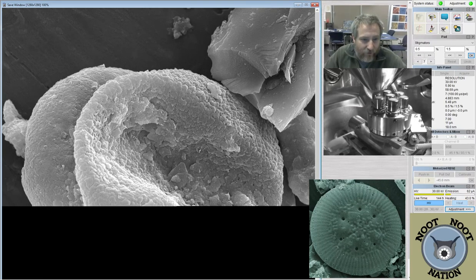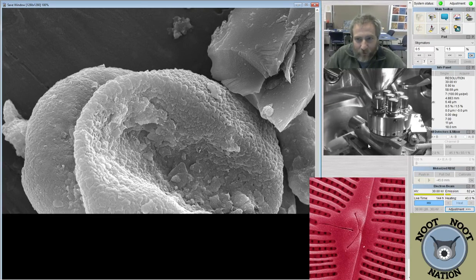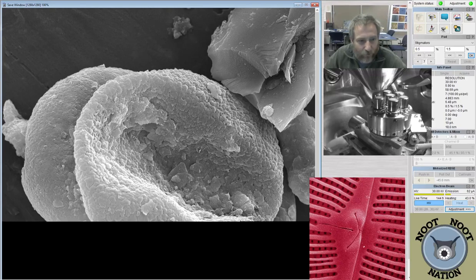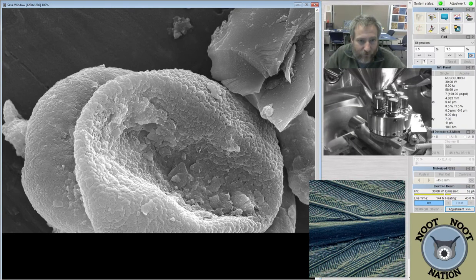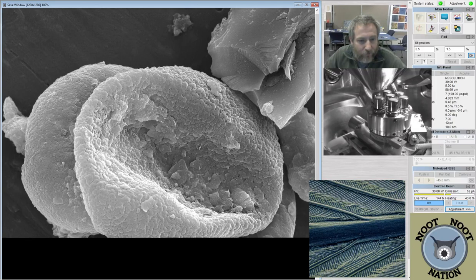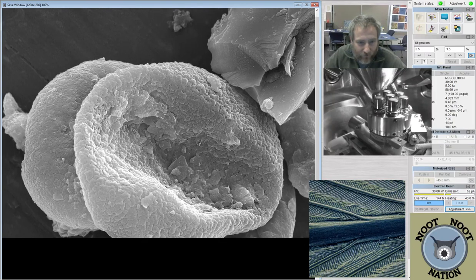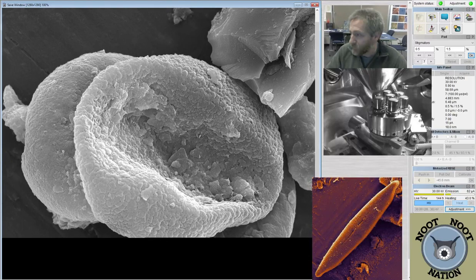In this case, the native quality of our image currently is roughly 6,000 times magnification. So about six times what you could get on a normal light microscope. And clearly that's why we can see the detail of the surface structure of this pine pollen. You can see bits of clay stuck to it that you would not normally be able to see in a light microscope.